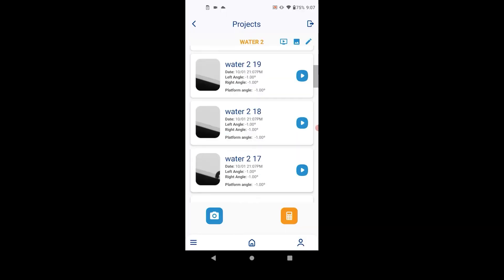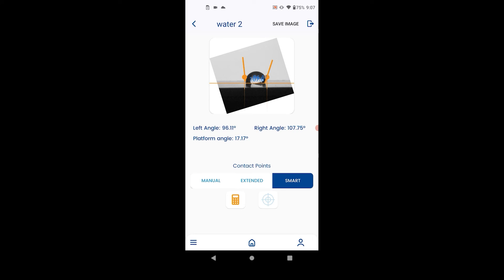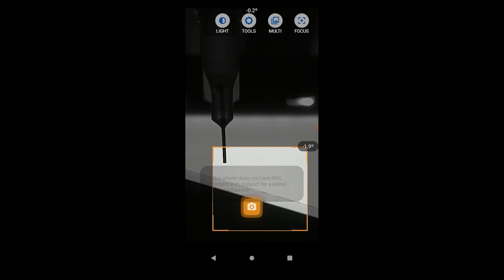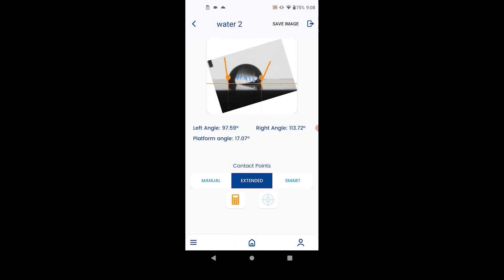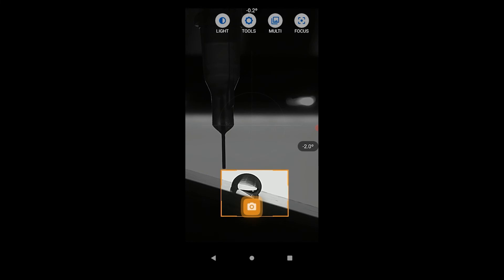Click into one of the images to make a measurement. The user only needs to provide an estimate for the baseline and left-right contact points; the system auto-detects the exact contact points. Hit calculate to complete the measurement. If the left contact point is not being measured at the baseline, this can be corrected by adjusting brightness during image capture or by switching to manual or extended points — extended uses more of the droplet profile to find the contact angle. Measurements can also be done on a pre-tilted stage, where the cropping window is shrunk to only select the area around the droplet.